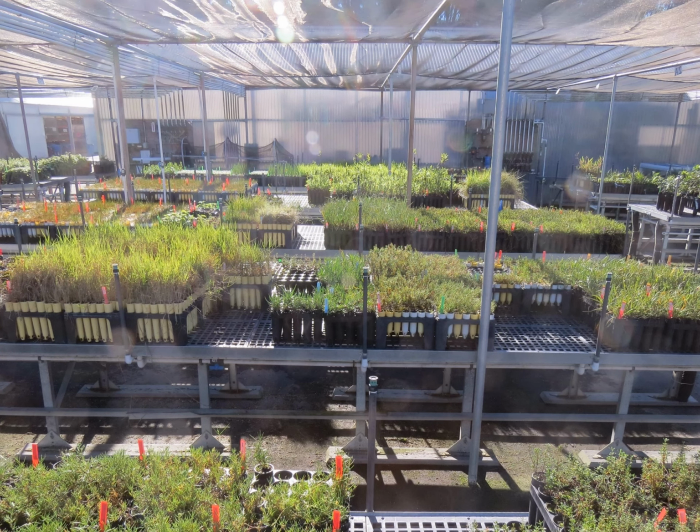So in a diverse nursery like this, we have several things that we're dealing with. We have a lot of different plants, a lot of different sized containers. They all have different propagation histories. And we're trying to determine, really, in a clean production system, are we functionally keeping these plants clean? So where would we expect to find Phytophthora, and how can we find it if it is indeed there?